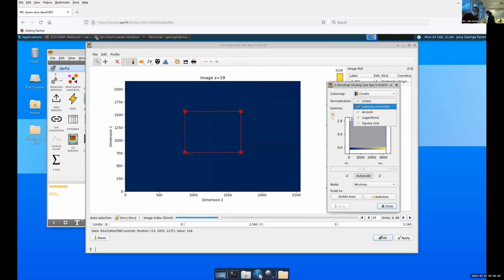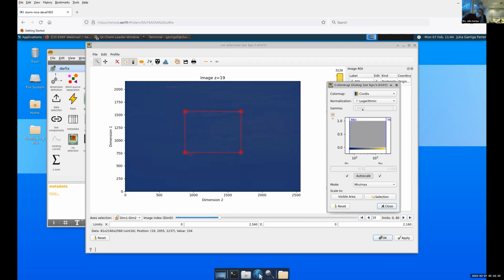Okay, so the first one was a single grain in the middle of the space. This is a continuous film that has been looked at in reflection, so it takes all the space you have. There's no such thing as clear borders around it. What you're going to want to do is cut a small region of interest that is representative enough, or that you can find some feature of interest in, so it's as light as possible. And so Julia chose a region in the center of the image.